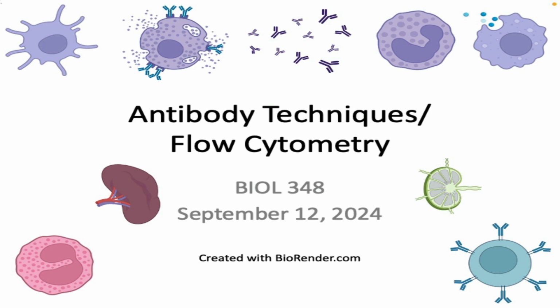But we are going to be talking about doing flow cytometry so much this semester. Flow cytometry is one of those things that immunologists read about, think about, and do all the time. And so I need to give you the background on flow cytometry and how it works.